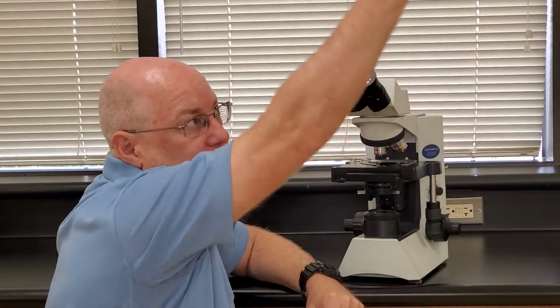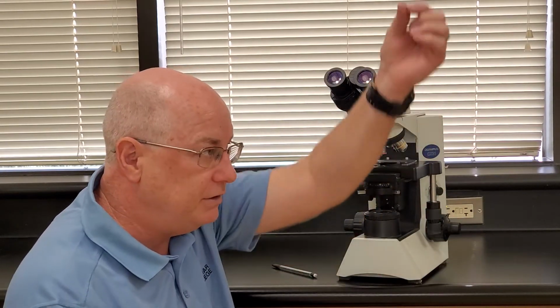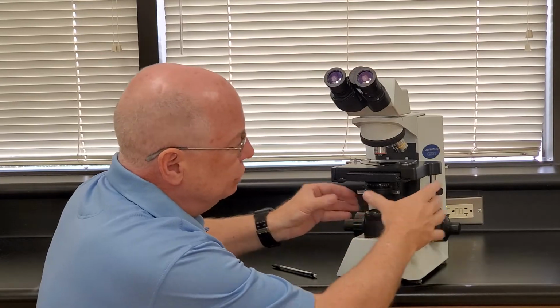The things we're looking at are so tiny that most of the light from this room would miss them. It would be like me shooting a shotgun, and across the room there's a single piece of thread hanging from the ceiling. If I'm 30 yards away, what's the likelihood any of the BBs from the shotgun are going to hit the thread? Pretty low. The BBs of the shotgun are similar. They represent the concept of the photons, and the thread is what we're trying to look at. Now, what if I took a big metal funnel so that all the BBs hit the funnel and were funneled to that thread through a little tiny hole? What's the likelihood a bunch of BBs are going to hit it now? Way high.